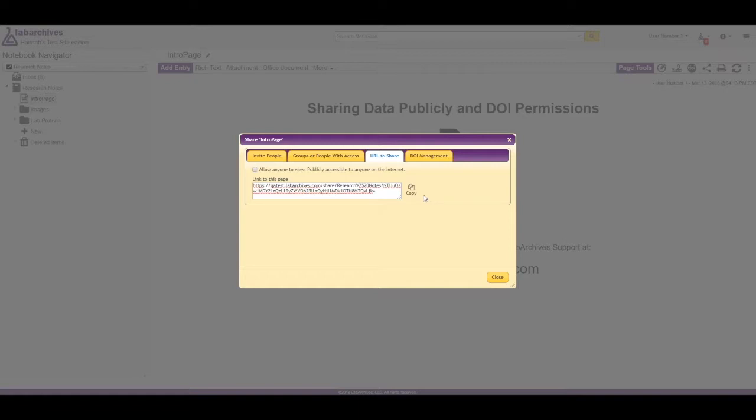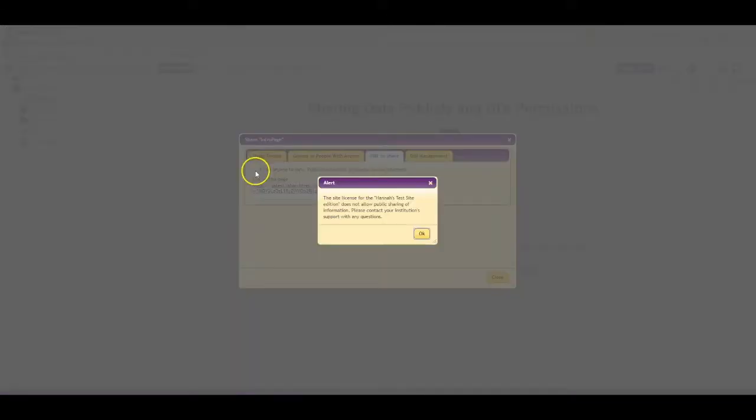If your institution allows public sharing, notebook owners and administrators can select allow anyone to view publicly accessible to anyone on the internet. If your institution prevents public sharing, you will see a message like this.